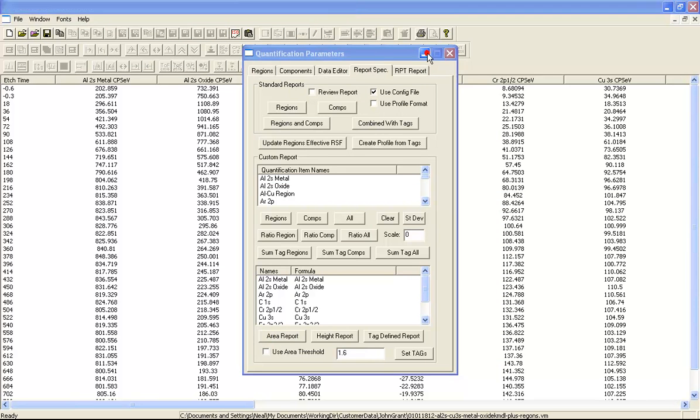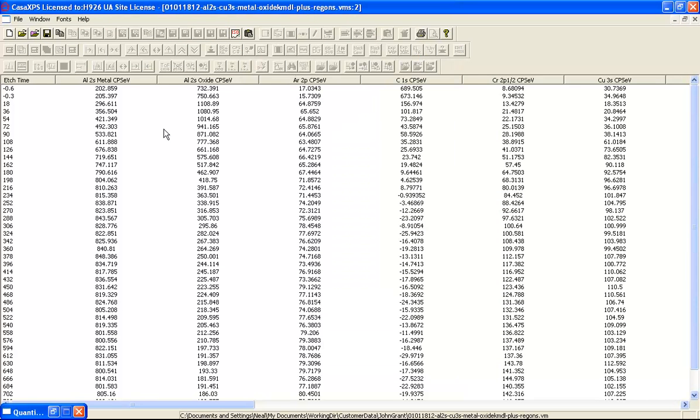This then creates a text report where the columns represent the signal that is calculated from each one of the regions or the components in the selected VAMAS blocks.